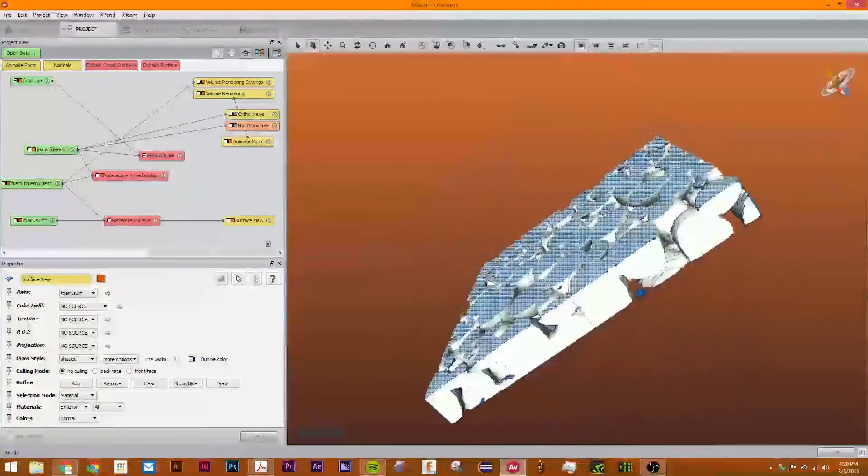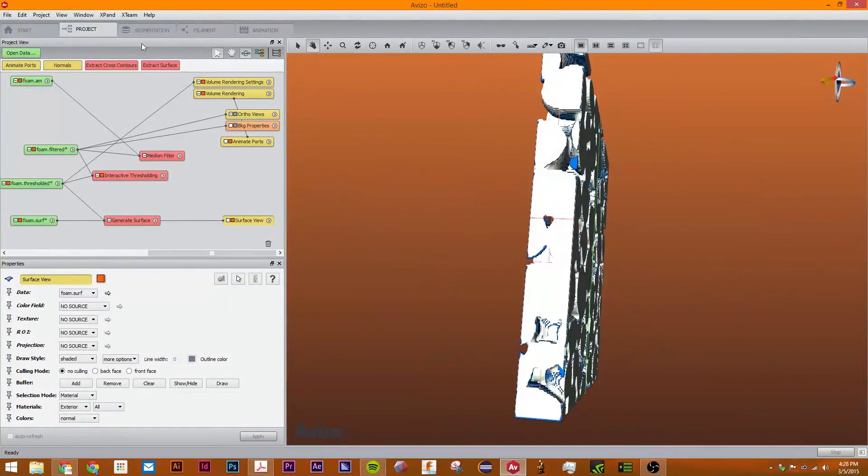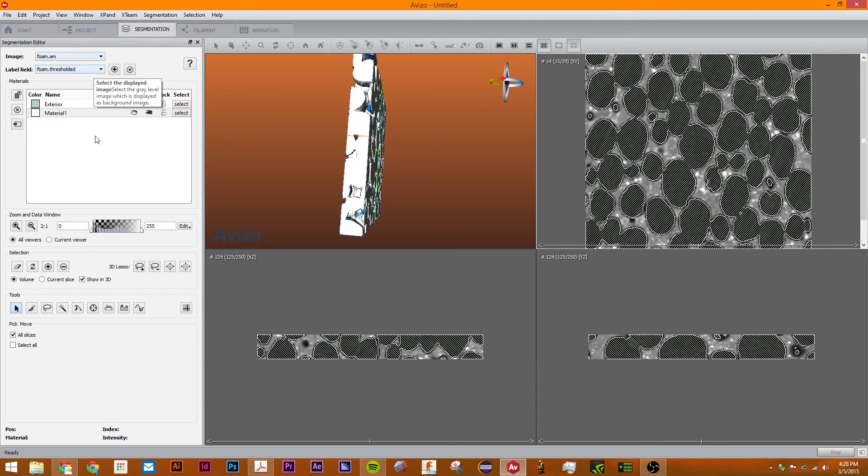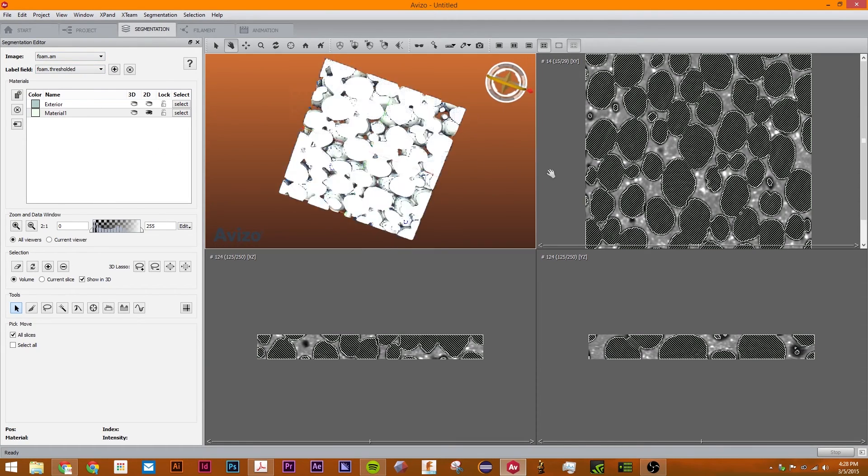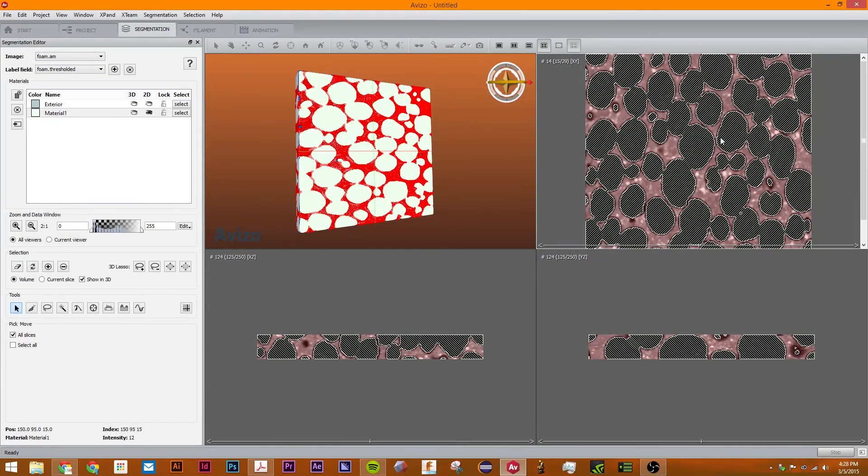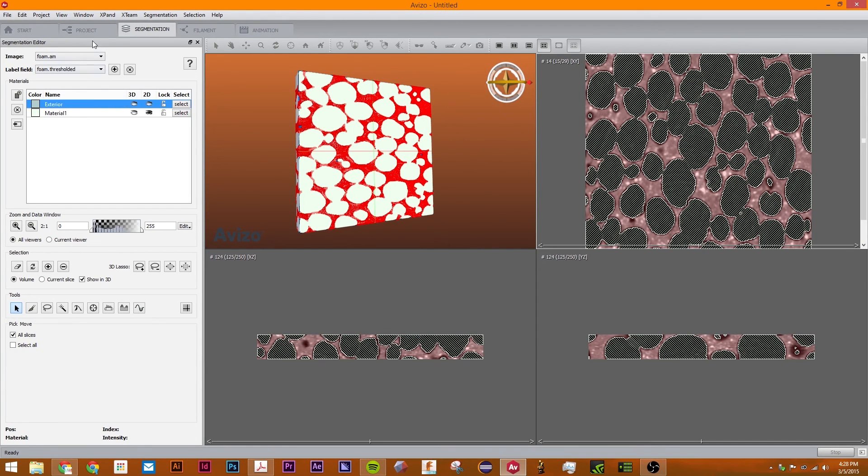This is much easier than going through all of the segmentation editor which takes a long time. As you can see this thresholded image has two different areas. The material 1 and the exterior.